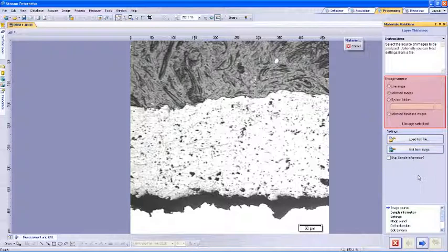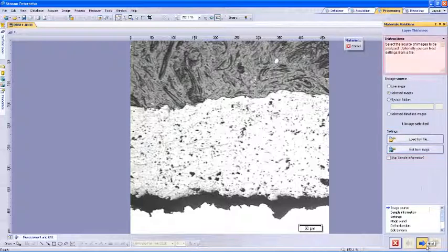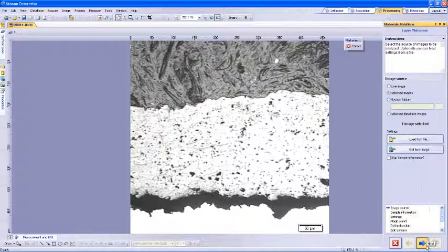Once the layer thickness window opens, it will start with the image source selection, the option to load settings, and the ability to skip the sample information section. At the top of the window, we have instructions that will guide us through each screen, and at the bottom, we will have the workflow list of this solution.